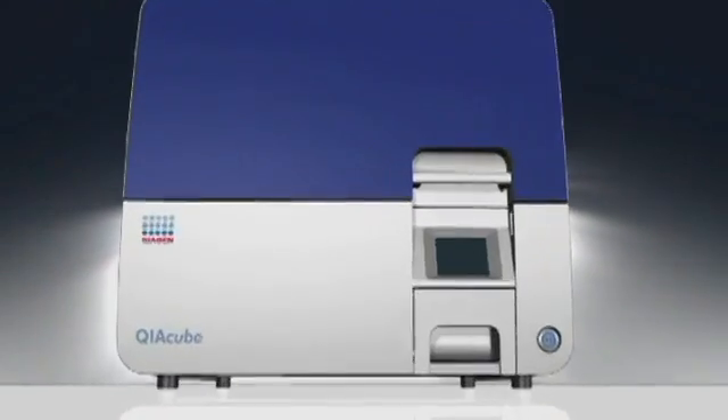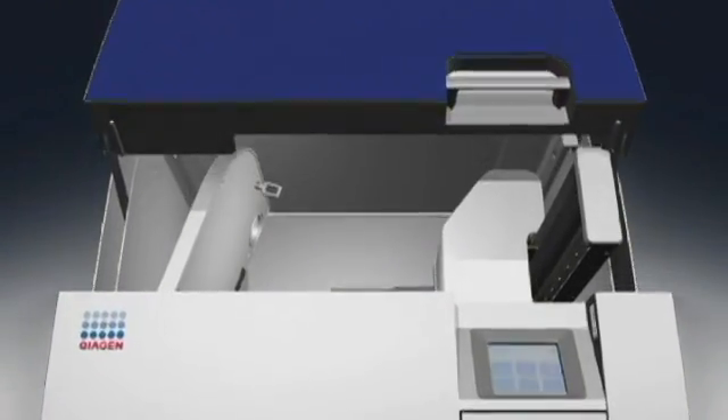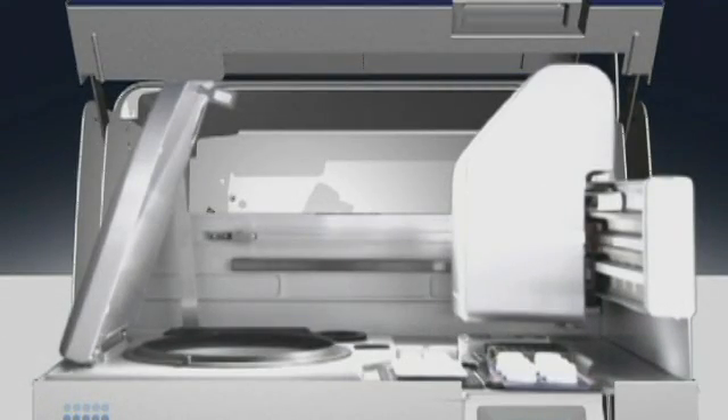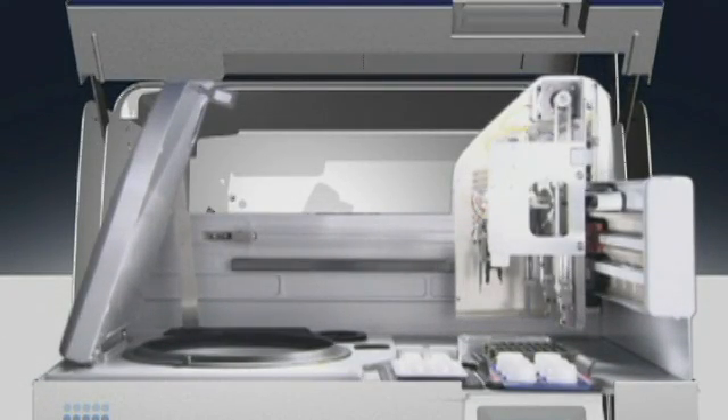Get ready for the beginning of a new era in sample prep. The Kaya Cube. The transition from manual to automated processing has never been easier. Leave spin column processing to the Kaya Cube. You have more important work to do.